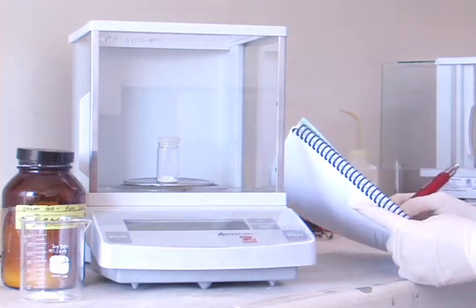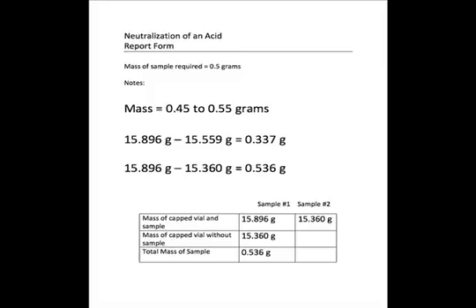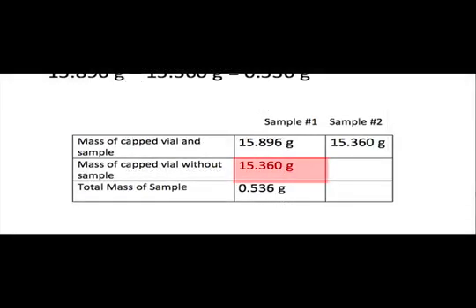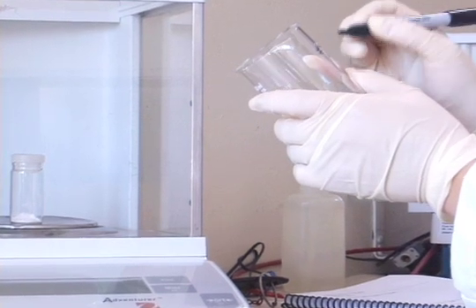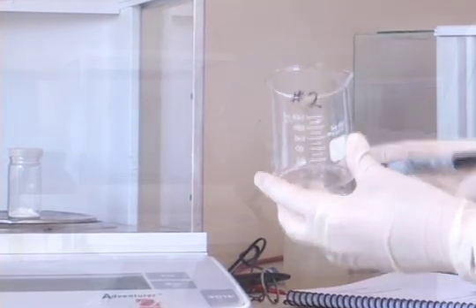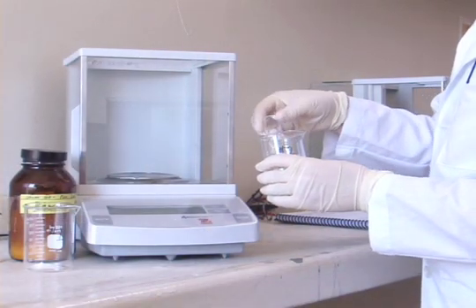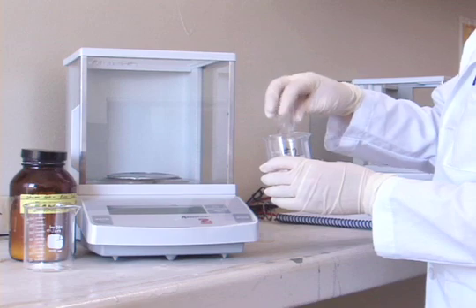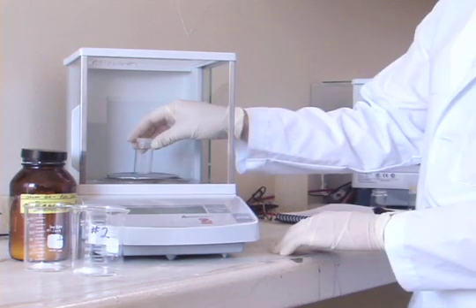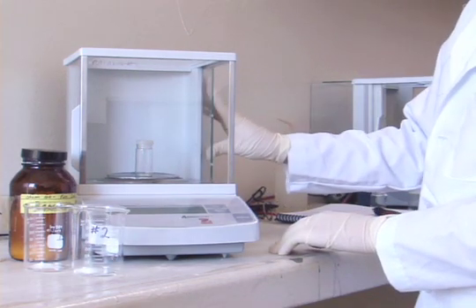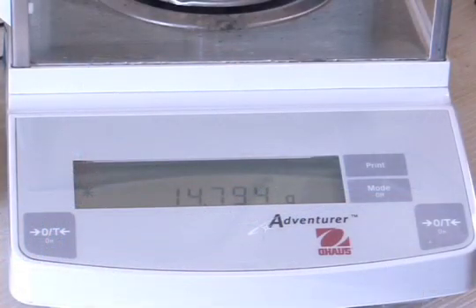On the report form, we enter our data and note that the final mass from sample number one becomes the initial mass of sample number two. To measure the second sample, we pour the remaining sample in our vial into the number two beaker and re-weigh the empty vial. The mass of the vial is now 14.794 grams.